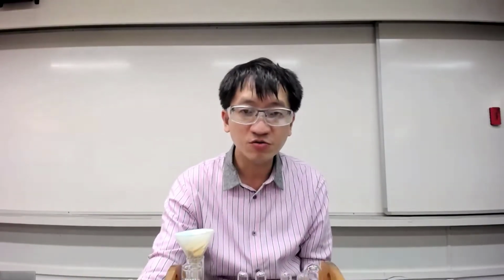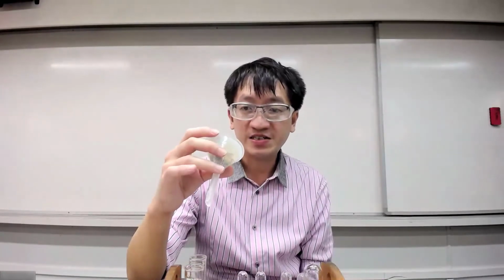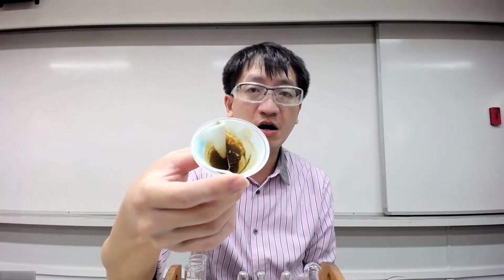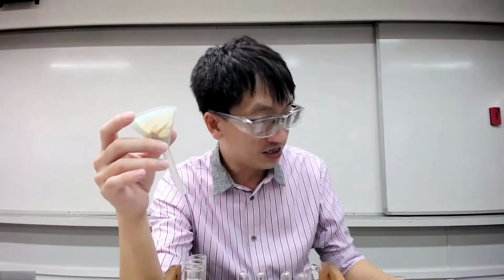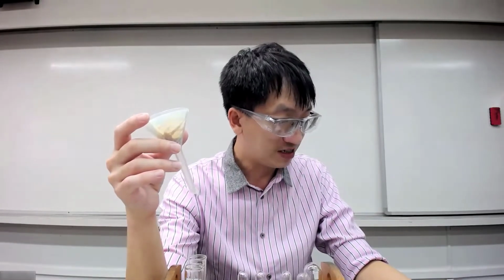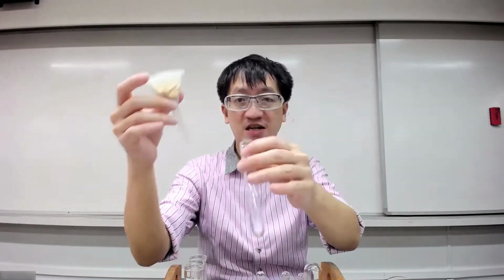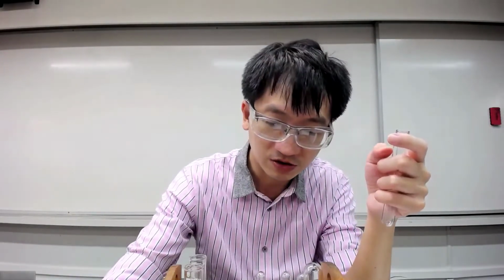Okay, students, we'll move on to experiment C from practical 14. This is the residue, which, if you remember what we did earlier, is reddish brown. It's not so obvious from the camera, but it's actually reddish brown in color. We're going to follow the instructions: put a filter funnel with the residue over a clean test tube, and then carefully add hydrochloric acid. So this is a clean test tube. Very carefully. You can see some residual water here, so I think we'll just dry it.